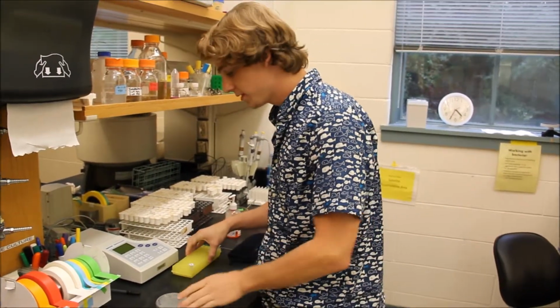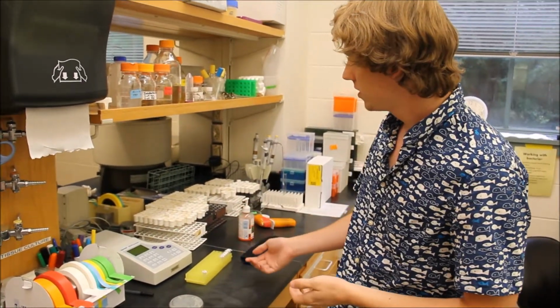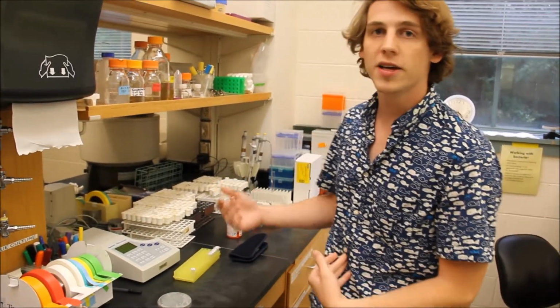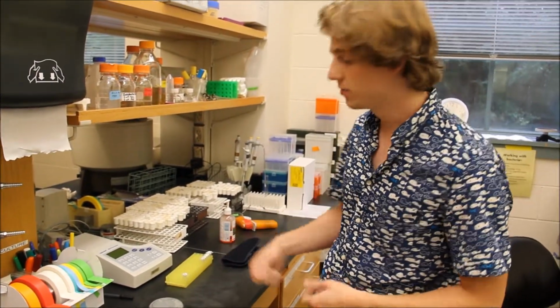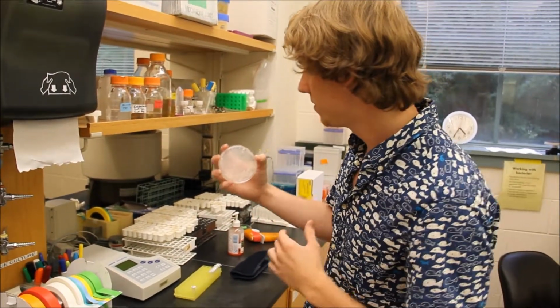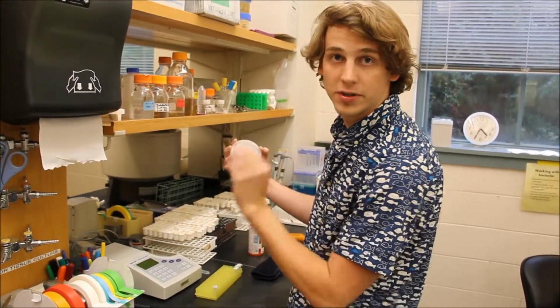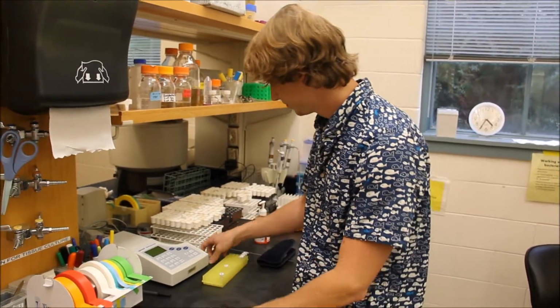One important aspect of this is to use your spectrophotometer to calculate the optical density of your cells. For this, you want around 0.6 OD. If you go a little too high, you can add more PB buffer. If you go a little low, you can add more cells to the mixture. This is kind of what we work with. We have Agrobacterium on plates, and we scoop off the plates into our tubes, and these are what we will use for infection once we get to an optimal density of 0.6.